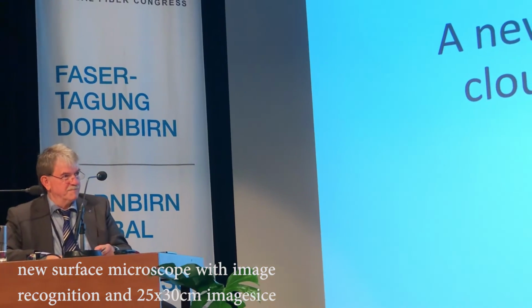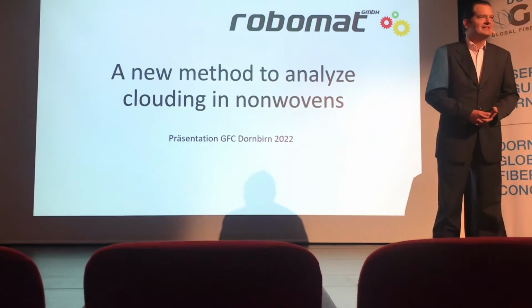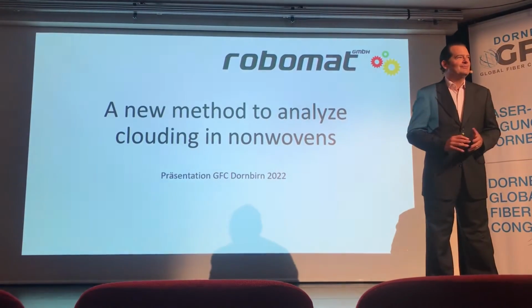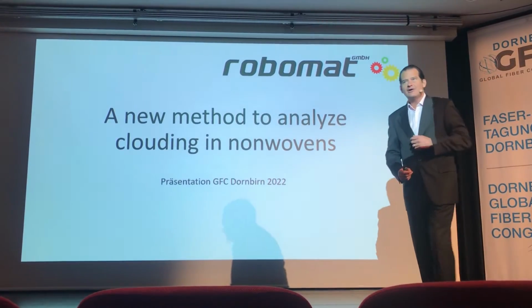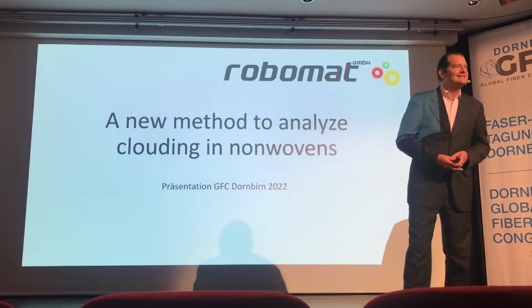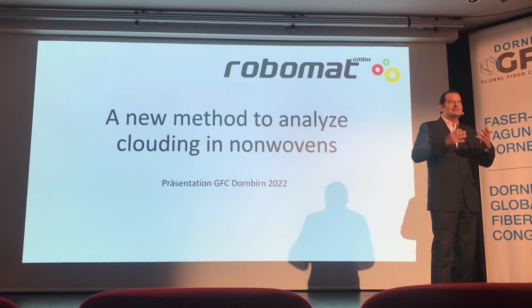Lind, it's yours. Gentlemen, digital photography and digital images are all around us, every single time. So in this room alone, there's probably 100 cameras. Take a picture of me now, and then you could zoom in and see whether I still have dark rings under my eyes after yesterday's party. So this is going to this extreme.